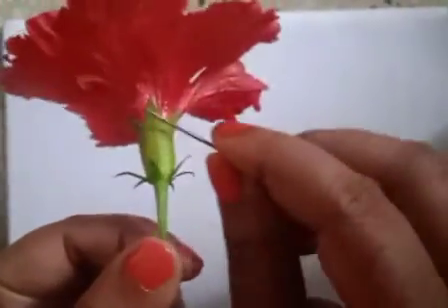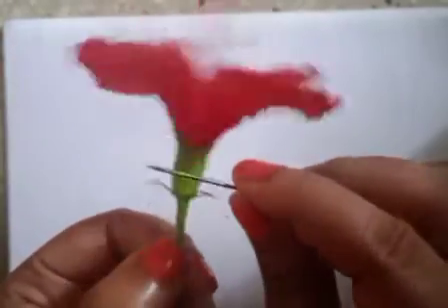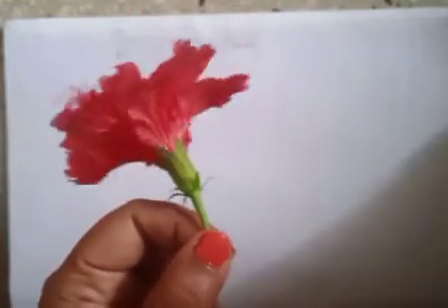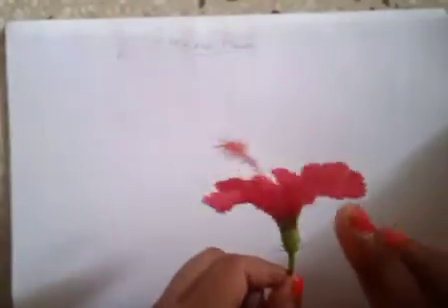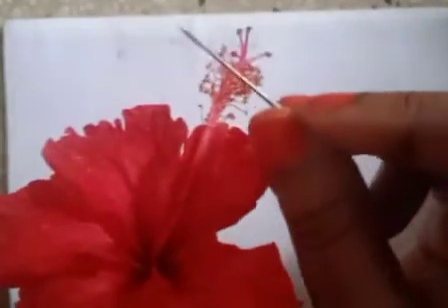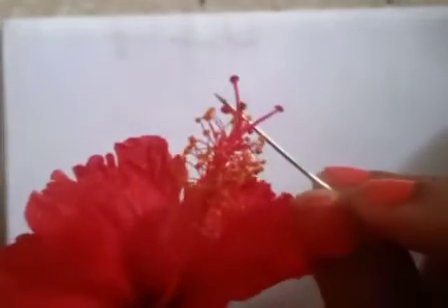Hibiscus flower. So in this, see, this is the epicalyx that we have. This is the calyx, this is a sepal, and this is an extension, and this is the epicalyx that we have. The red ones are the petals. Then we have a single lobed stamen. See, this is the stamen that we have. So many stamens, and above this, the five red ones that you see are the stigma.